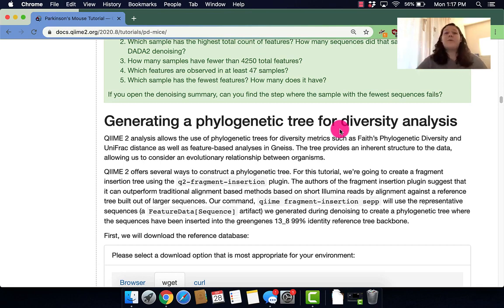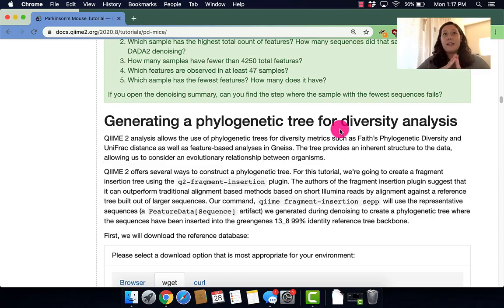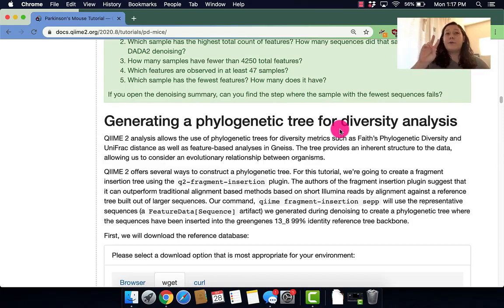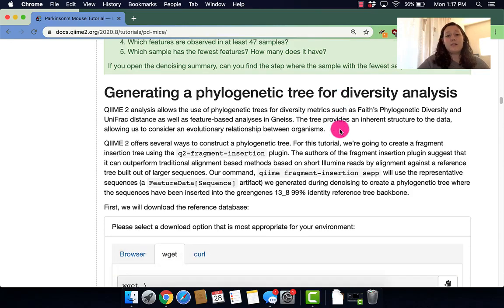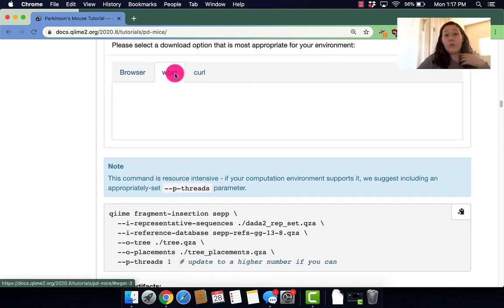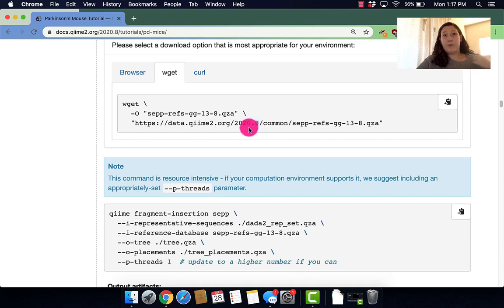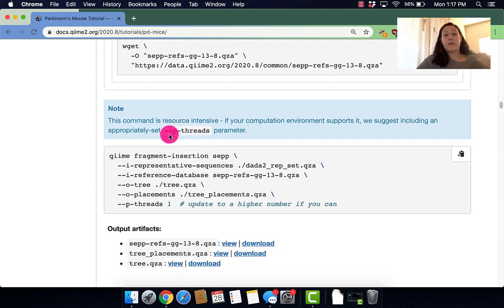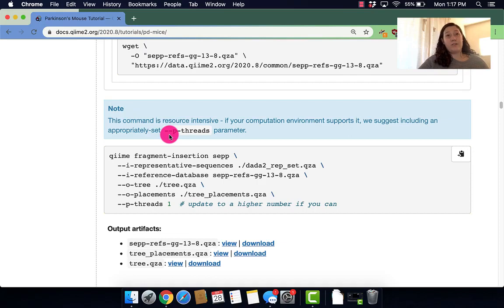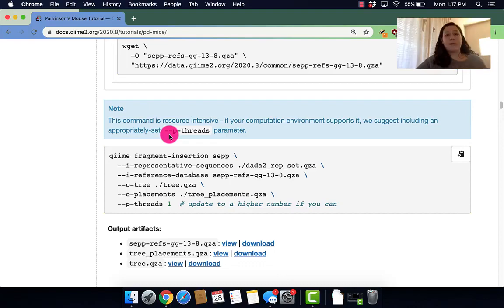Hi y'all and welcome to the section of the tutorial where we generate a phylogenetic tree for diversity analysis. In this section we'll be running two main commands. The first one being wget where we'll get our reference tree from the internet, and the second one being qiime fragment-insertion sepp which is where we insert our sequences into that reference tree. But I'll explain all of that a little bit later.